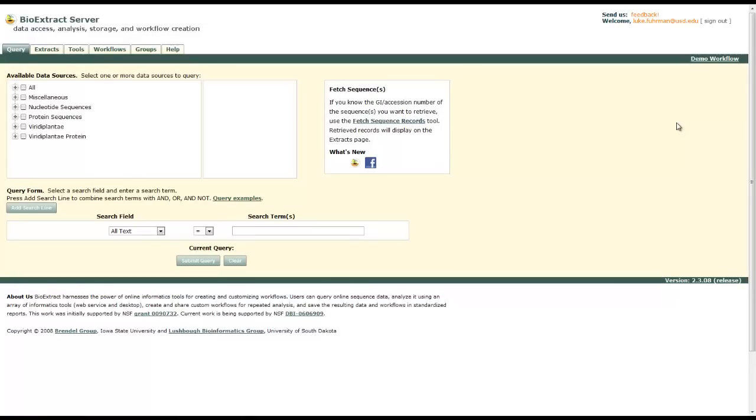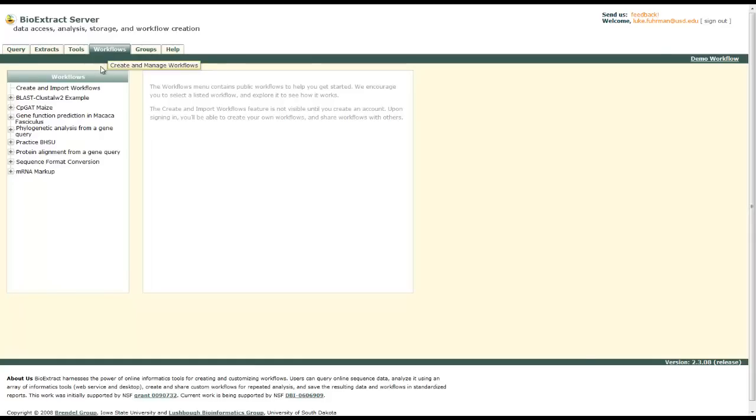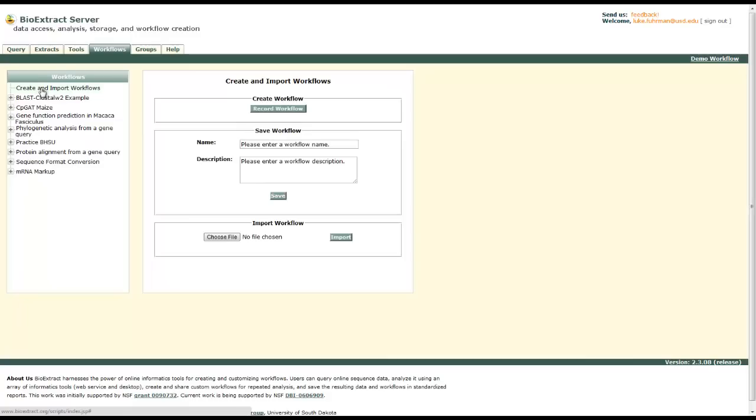Once you've signed in, go to the workflows tab and on the left at the top, create and import workflows. This will allow us to save workflows for later usage.